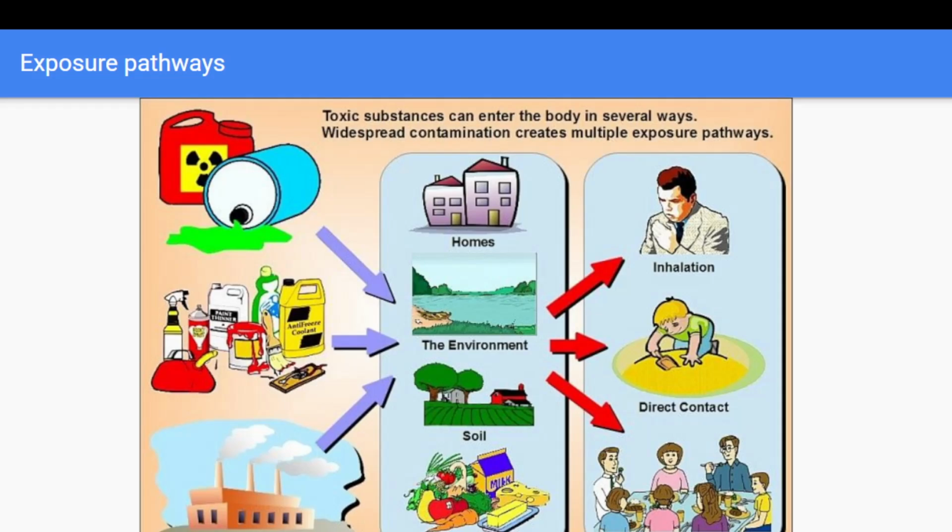Along with mixing chemicals, you also have to be aware of how to dispose of chemicals properly. We can't just dump hazardous chemicals down the drain unless the SDS says you can. So read the SDS, find the disposal section, and then follow the disposal method in the SDS.